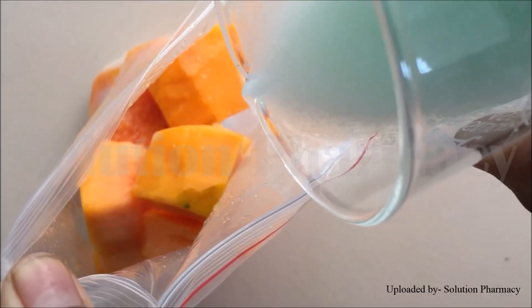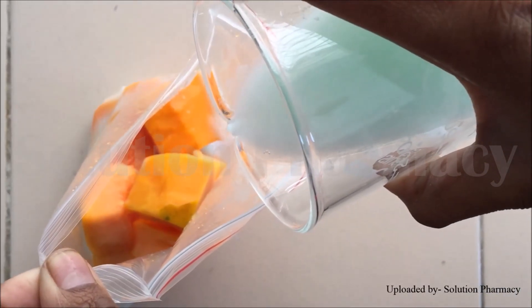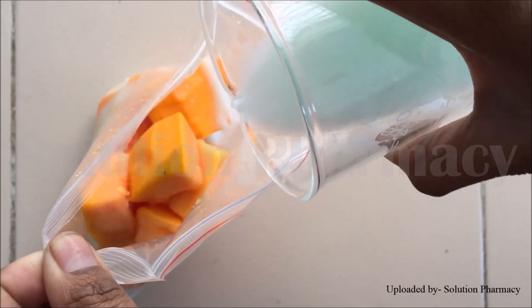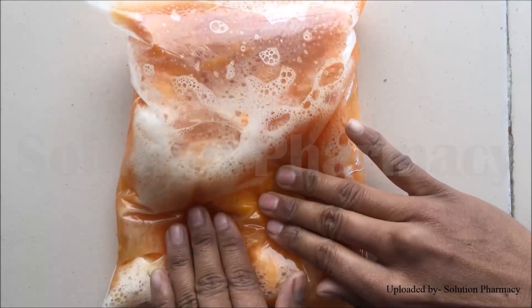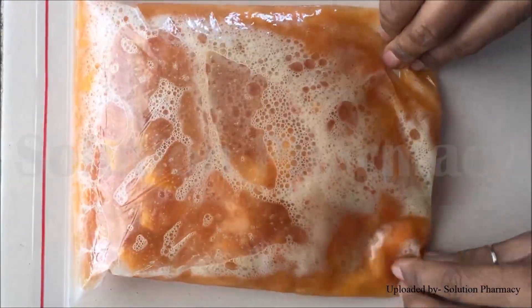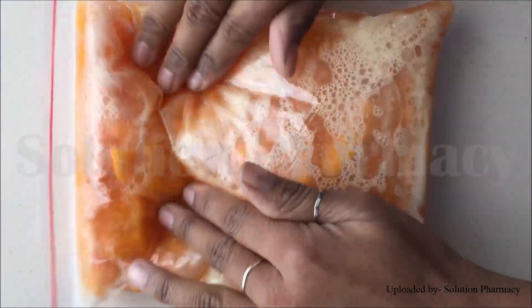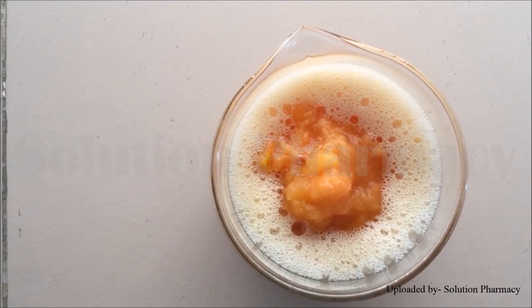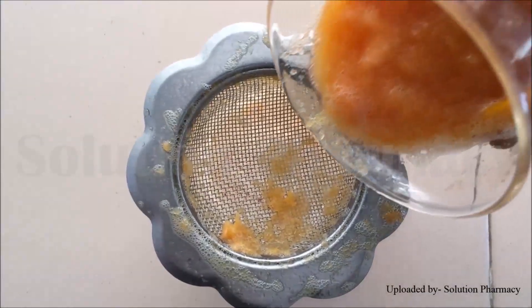Mix the contents of the beaker properly with the help of a glass rod, then transfer this salt and liquid soap solution into the chopped papaya pieces inside the poly bag. Now crush the papaya pieces with this solution of liquid soap and salt to isolate the DNA present in the cells. Mash all the pieces properly so that the solution penetrates inside the cell and DNA gets released.